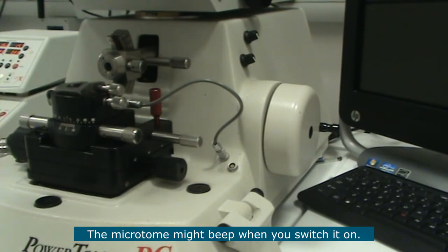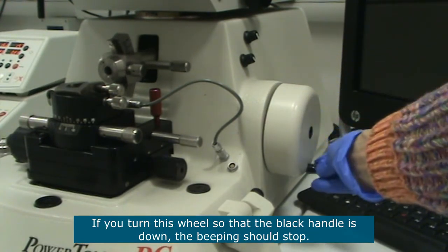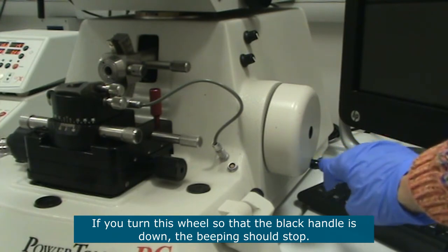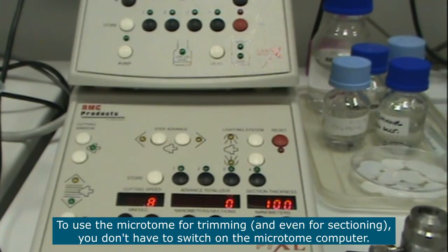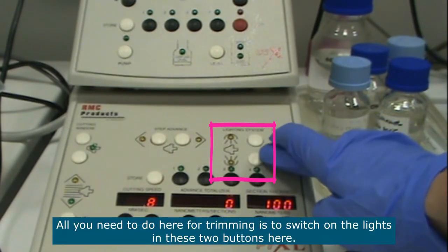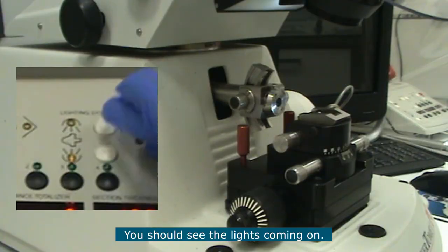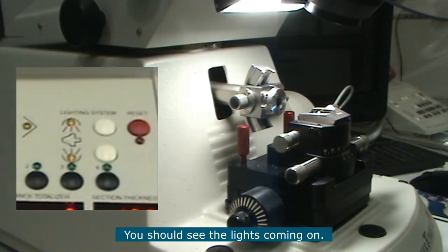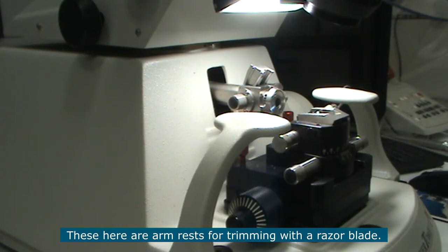The microtome might make a beeping noise when you switch it on. This is to do with the positioning of this wheel here. If you turn this wheel so that the black handle is down, you should be able to stop that beeping noise. To use the microtome for trimming — and in fact even for sectioning — you don't actually need to switch on the computer attached to the microtome. All you need to do for trimming is to switch on the lights using these two buttons here.